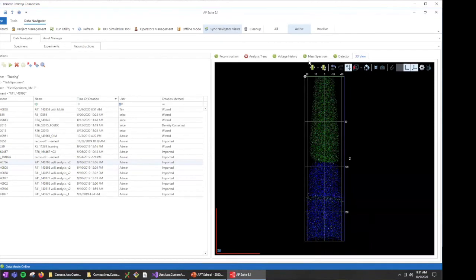It only works if you have ranges that you've created in Davis, and if you do have ranges, it will automatically create a default reconstruction for you at the end of your run. Well, and it's generating a live reconstruction for you during the run that you can interact with. Exactly. Yeah.